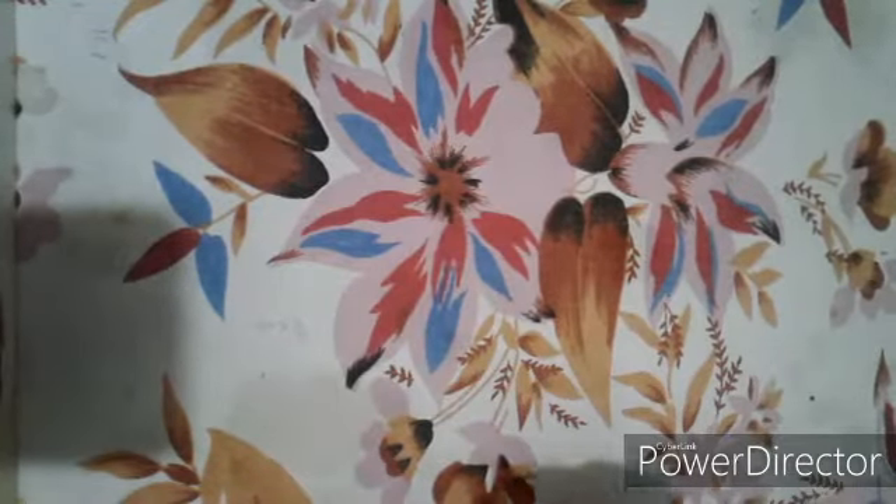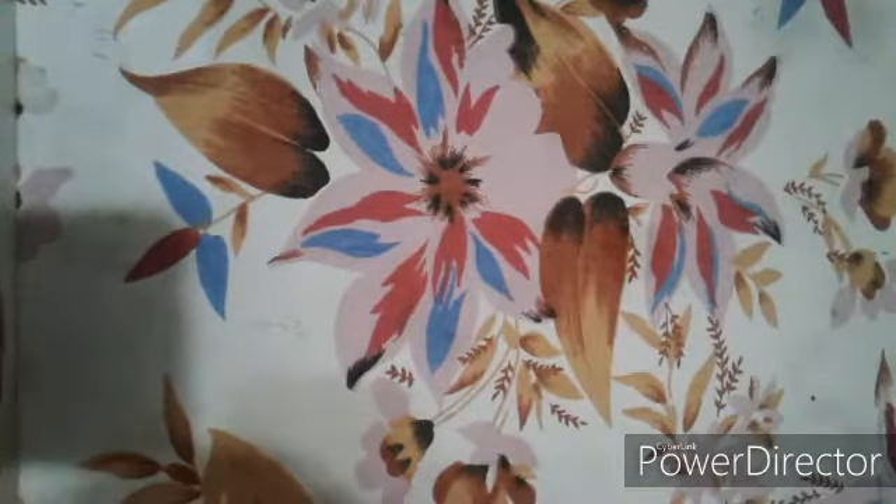Hi friends, here I am again. In today's video I'm going to tell you how to make a slide of stomata, so let's start.